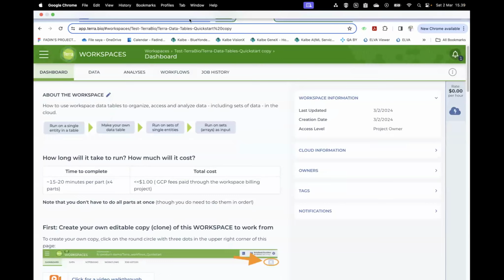Excuse me. Yeah, there's a question on chat. Please check it. Oh, okay. Why is my table specimen, not sample?